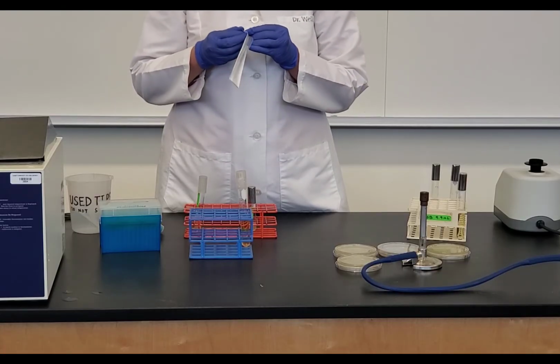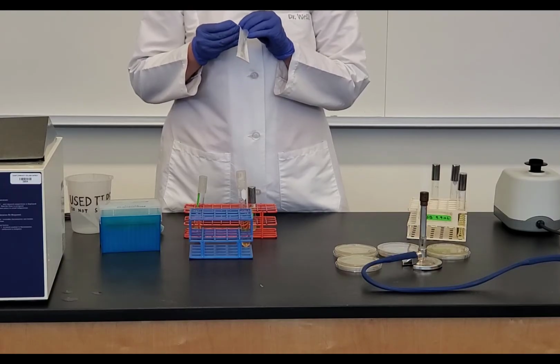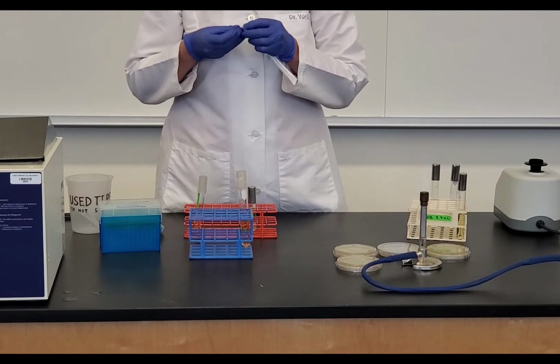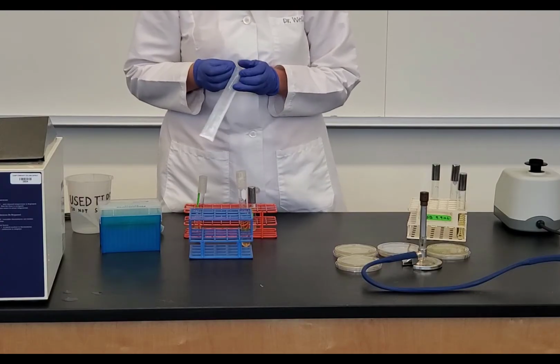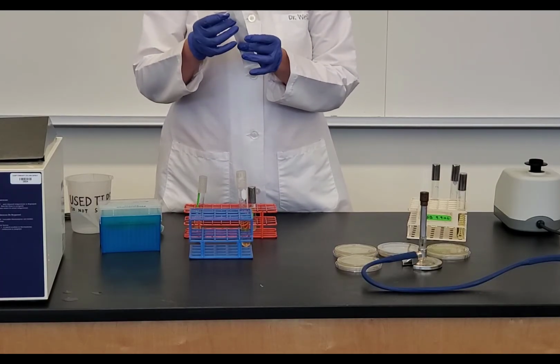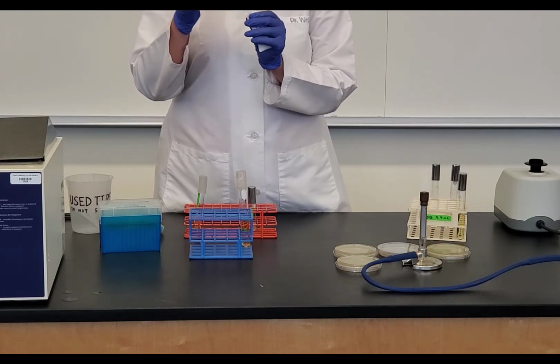So I'm going to open this. This is sterile. All right, so I'm opening this up. And again, I want to keep this as sterile as possible, so I'm keeping it in the wrapper until I'm ready to use it.